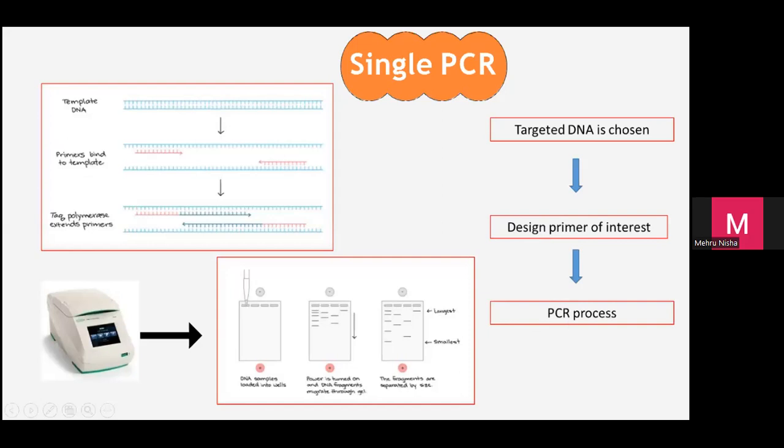Bila kita dah buat PCR di tube, ini machine, okay, dah habis, you kena prepare the gel. Okay, ini we call it agarose gel lah. Di gel ini kita akan load the DNA. DNA kita adalah charge negatif. Jadi it will move to the positive charge.